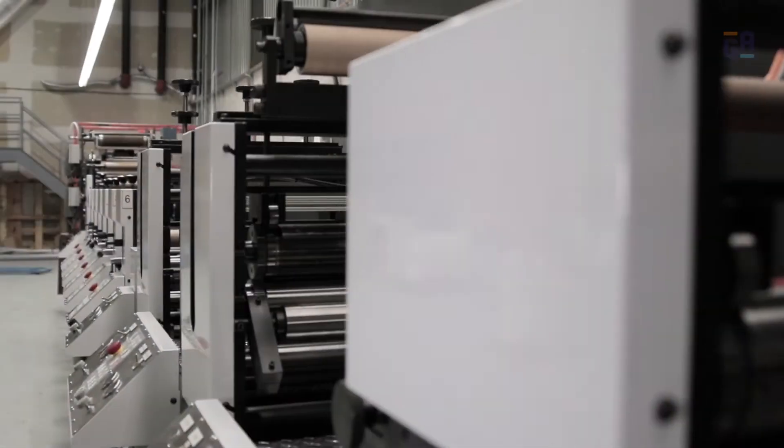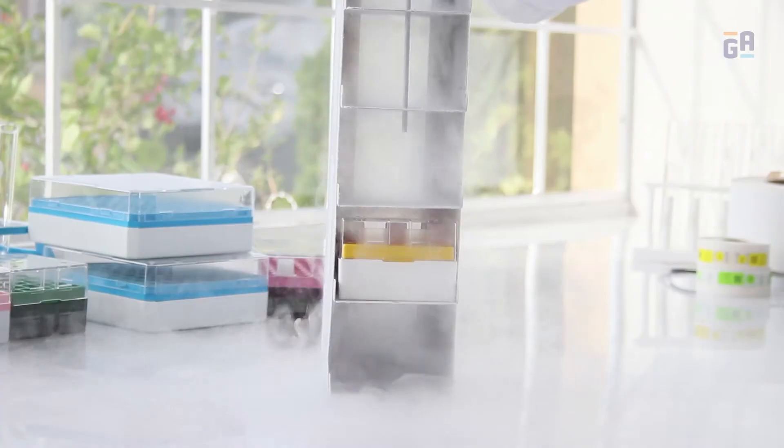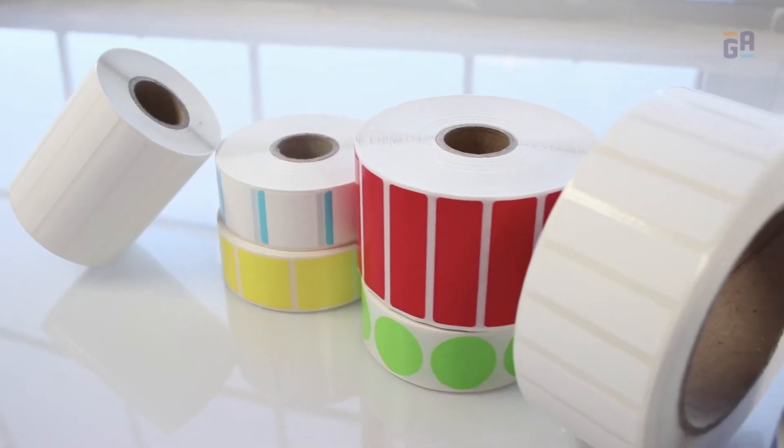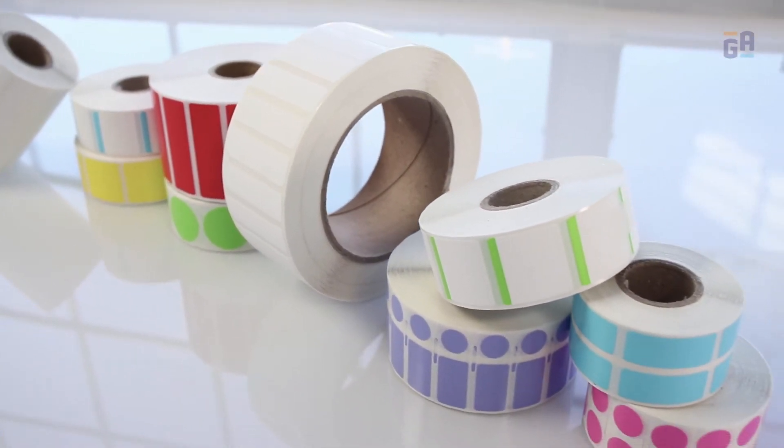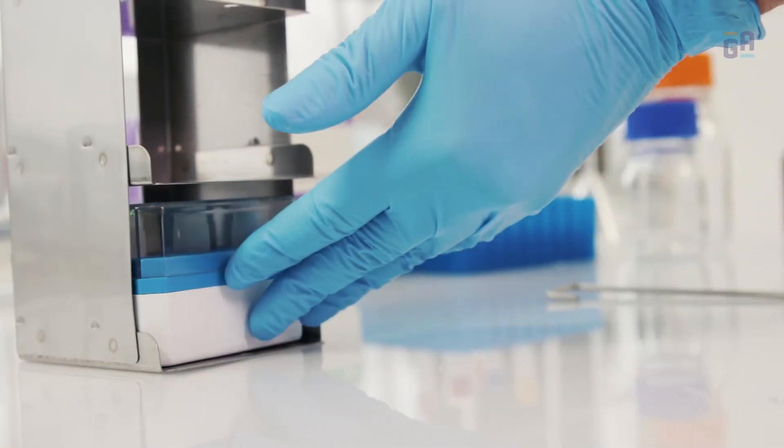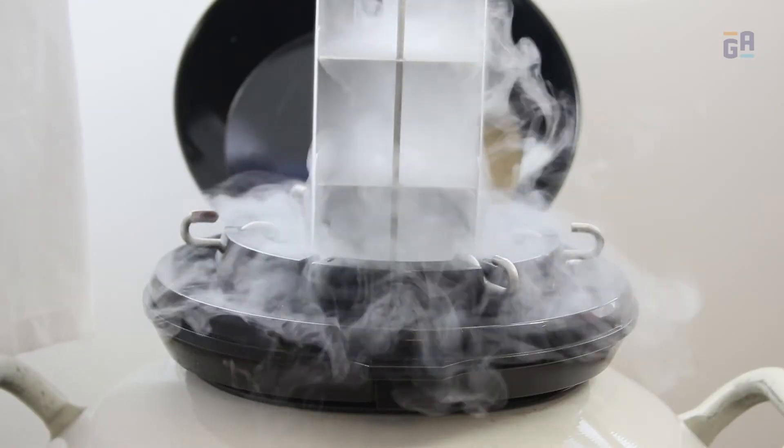At GA International, our specialty is creating labels that work under any extreme condition, which is why we have created an entire family of cryogenic labels designed for storing samples in ultra-low temperature freezers, dry ice, as well as liquid nitrogen and helium.